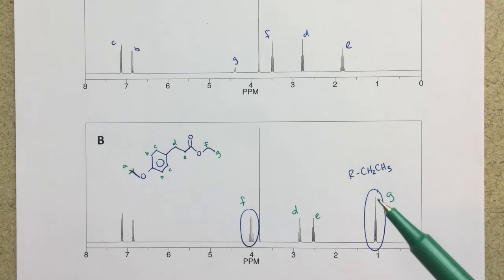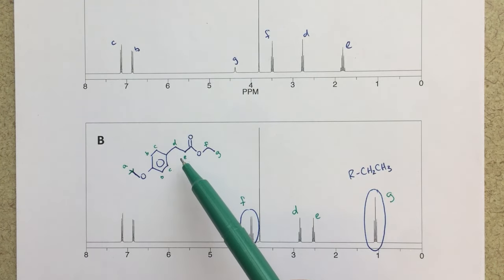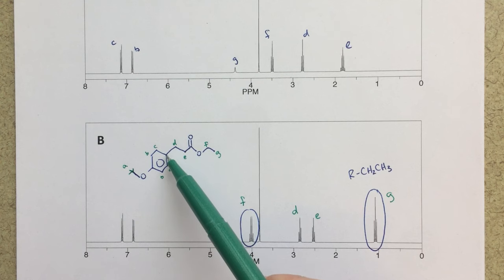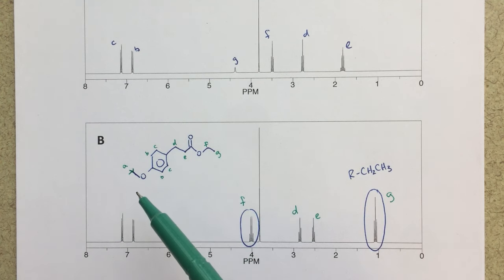My rationale there, I guess, as we look at this, this D is going to be directly bonded to my aromatic ring. That's going to shift it downfield a little bit. Depending on your instructor, they might be meaner about this D and E, but I'm going to go with that. I think that's a good guess.